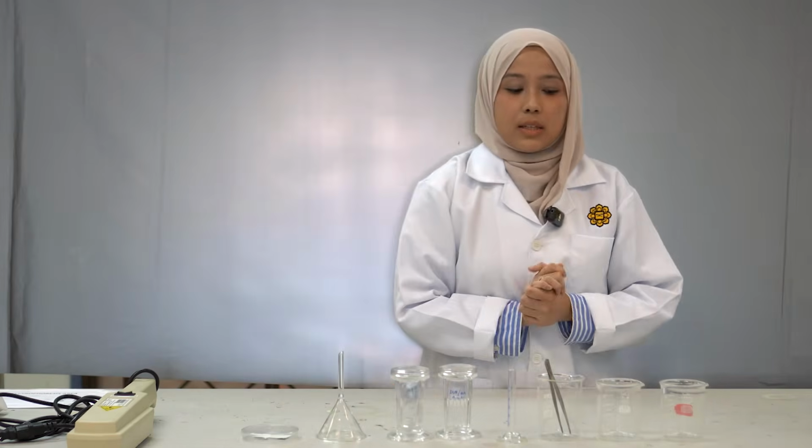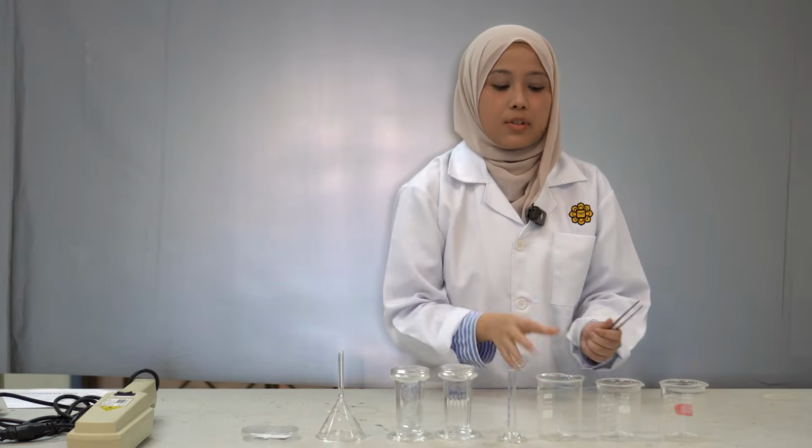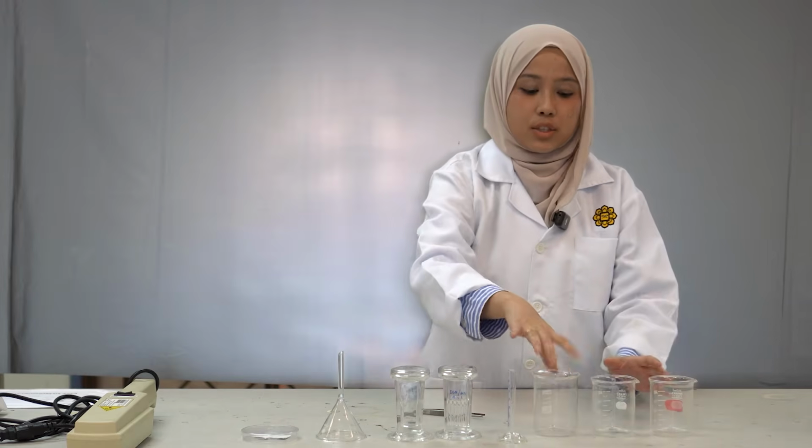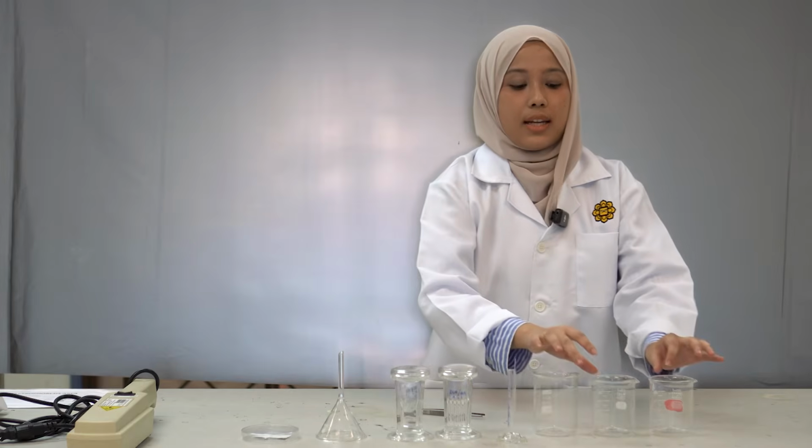To start the experiment, first we will prepare the samples. We will have three different samples: acid, base and neutral. Each sample we will mix with 5 ml of dichloromethane, and then set it aside. Next we will prepare the developing solvent.